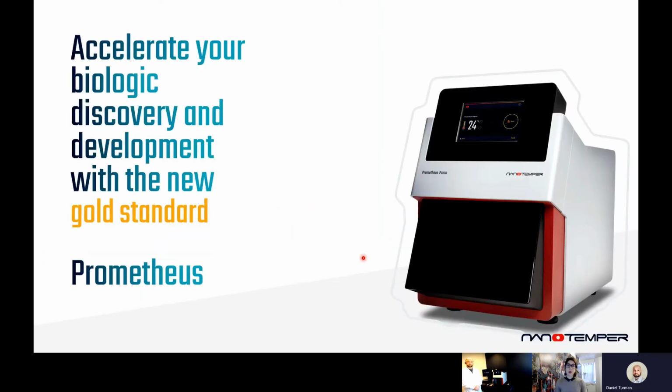So to conclude, with the Prometheus Panta, therapeutic thermodynamics can be characterized by monitoring protein unfolding, large aggregation can be looked at through turbidity measurements, and particle sizing can now be assessed with the addition of the DLS optics, which are all easily obtained and analyzed using our control and stability analysis software.